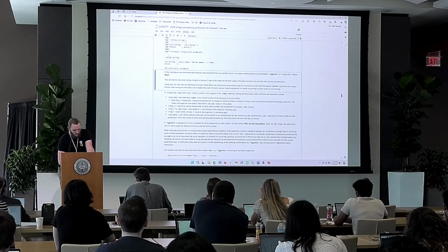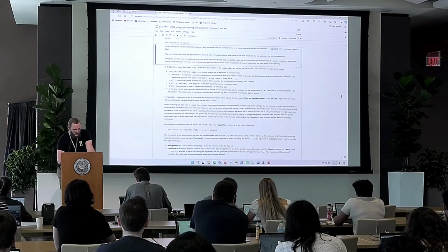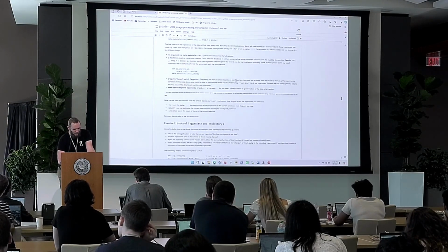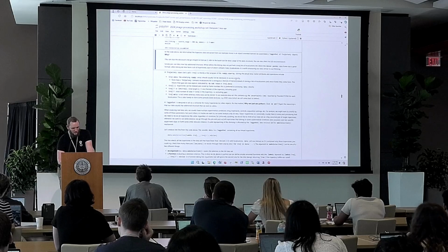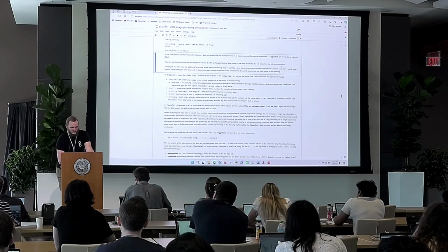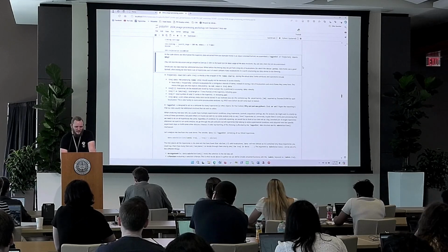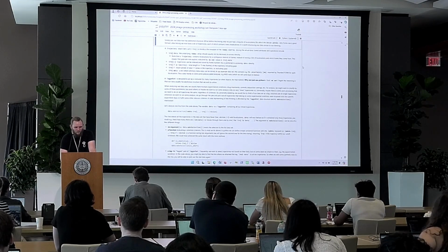It outputs a little message saying that we have about 300 trajectories from this movie, and which linker settings we used. Here there's a bit of a wall of text on how these objects that we just created work. Full disclaimer, this is a library that I wrote to deal with trajectories and fluorescence microscopy datasets, so I don't expect you to be familiar with it.